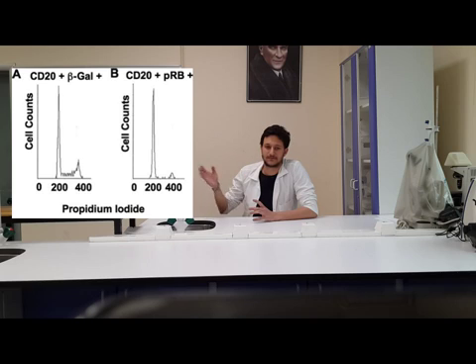In our last example, pRB deficient SAOS2 cells are transfected with an expression vector of either CMV-RB or CMV-beta-gal as a control. 3 days following transfection, cells were harvested, stained and fixed. Flow cytometry analysis of these cells is shown in the figure. This demonstrates the cell cycle distribution of negative control transfected cells in comparison with the distribution following 72 hours of pRB expression.